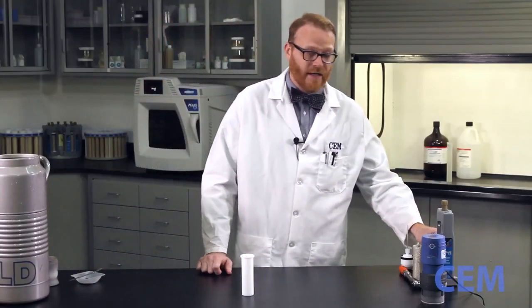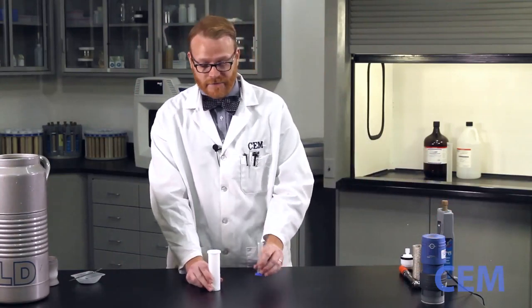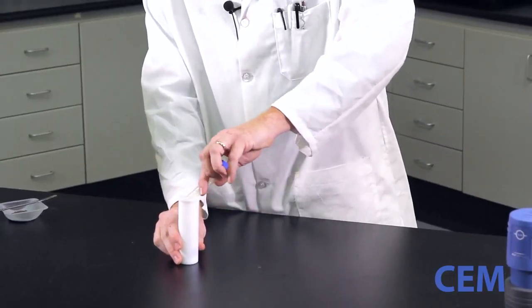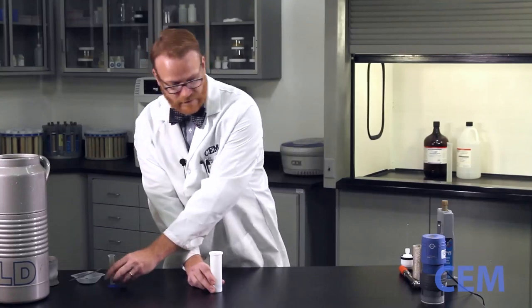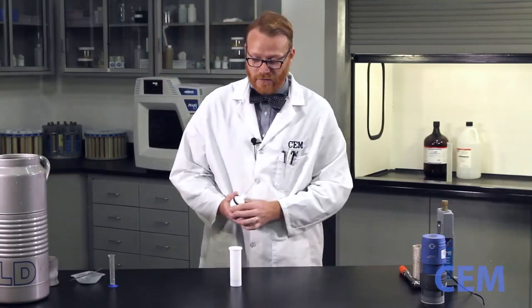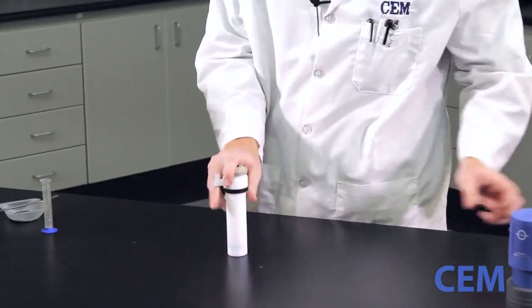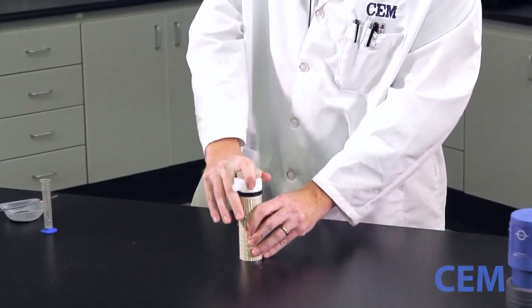We're going to take 10 milliliters of nitric acid. Pour that in. And we're going to use the control vessel here. Assemble it.